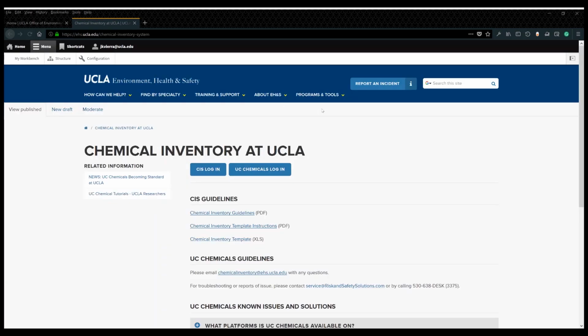You'll be able to find all our tutorials here, as well as any known issues to better facilitate how to manage and work within UC Chemicals for UCLA. You can also find UC Chemicals login by simply Googling UC Chemicals or UCLA Chemical Inventory.